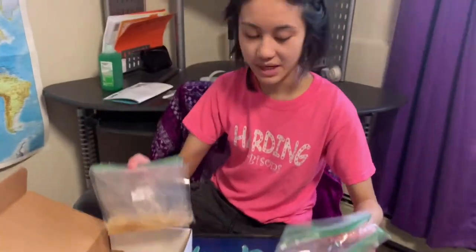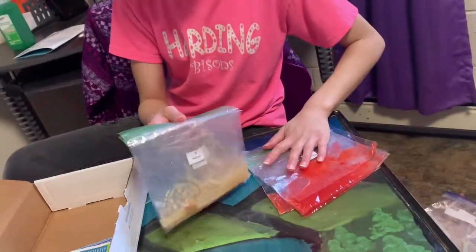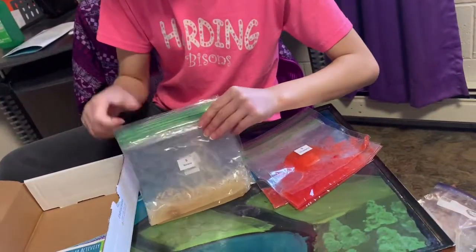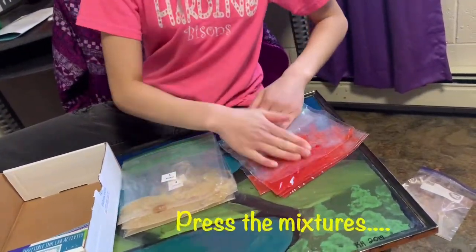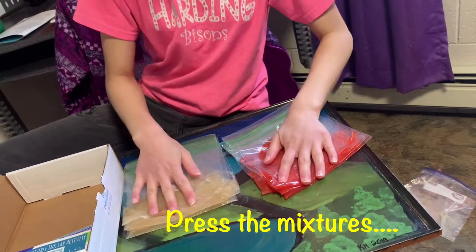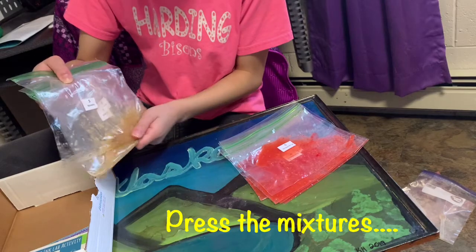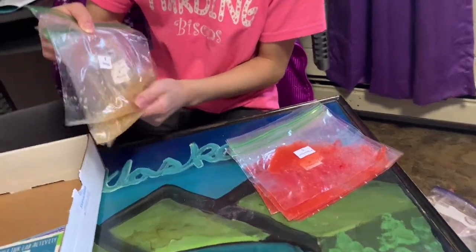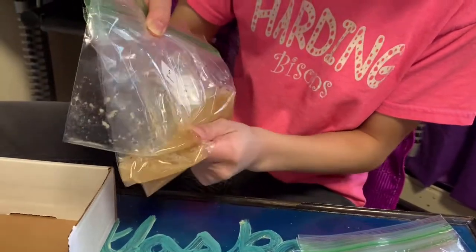Okay, now we're going to mash these bags for 30 seconds. We're just gonna mash it. And it's closed, so it's supposed to be closed. I hear some. It's not, so we're just gonna mash it. As you can see, it's getting softer.